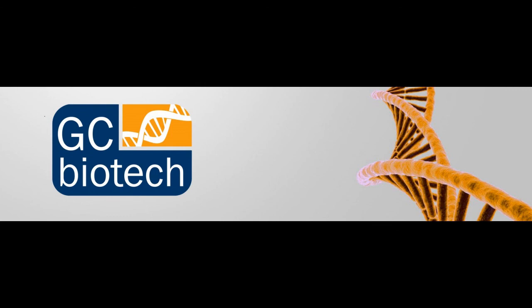Oh, okay, thanks. So basically, the contamination detection that we put in place on the DS11 is really based around things like purity ratios, and spectral analysis is confined to checking for things like negative spectra.